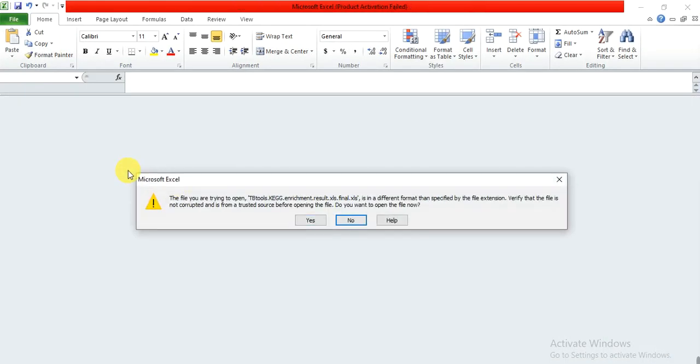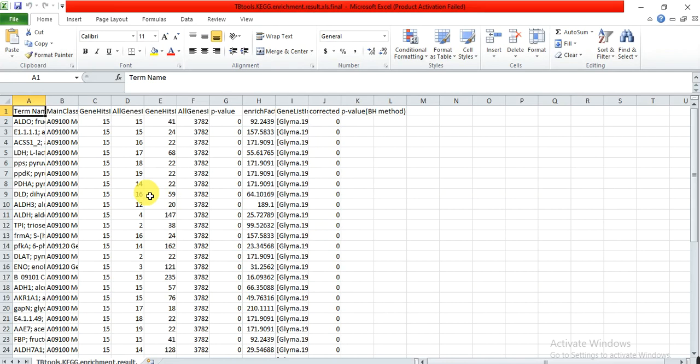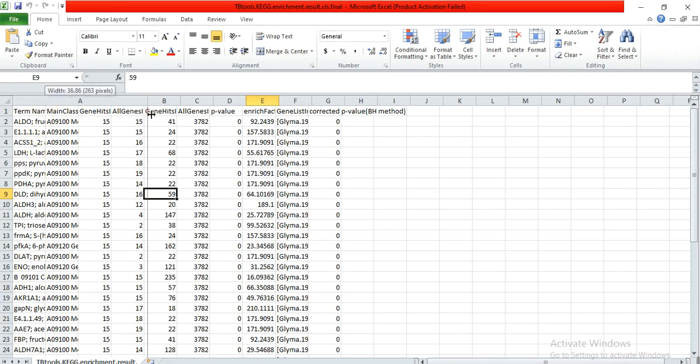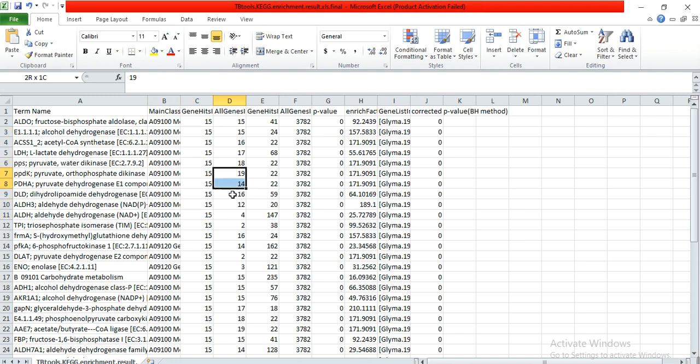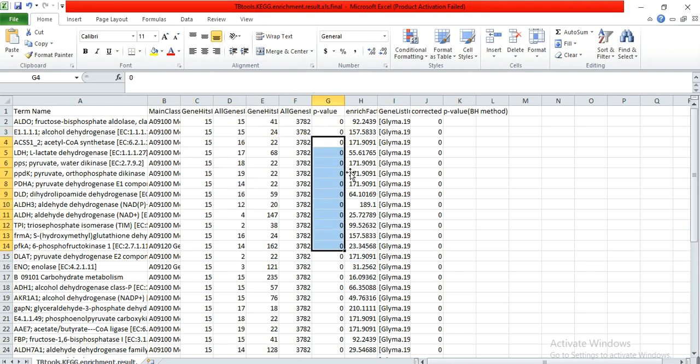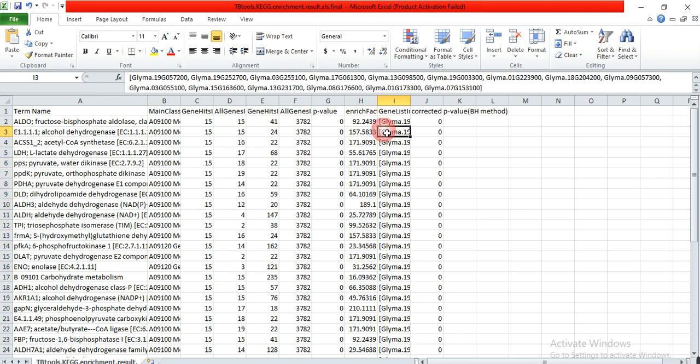You will get this file which contains biosynthesis pathways. This is the pathway, these are the genes involved in that pathway, the enrichment p-value and enrichment value, and these are the genes that were involved in this pathway.